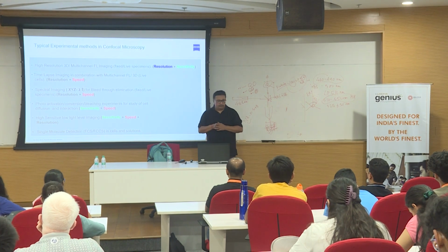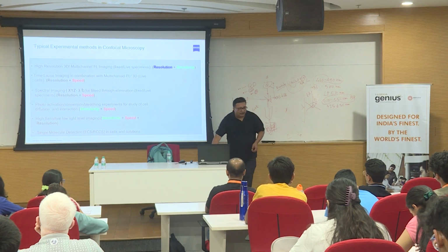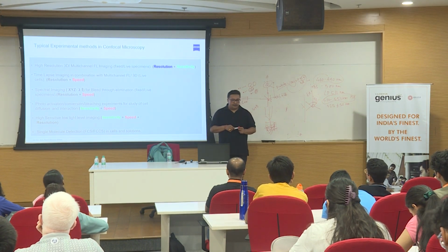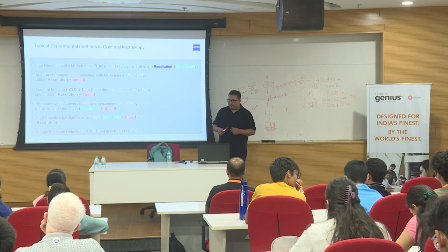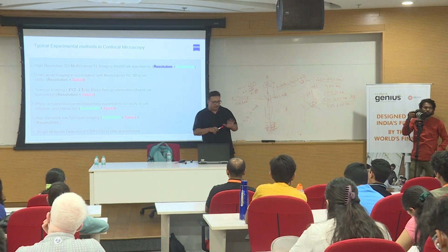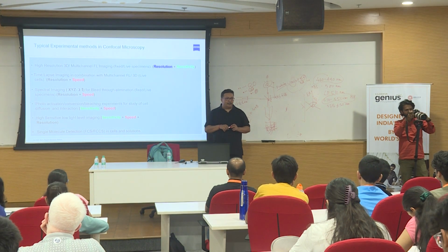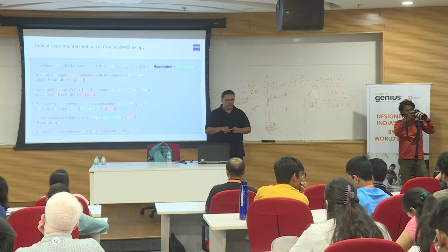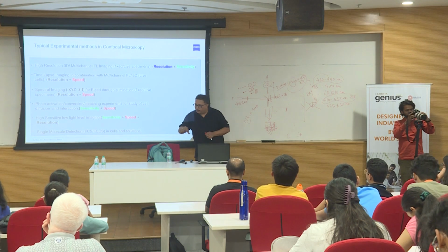Okay. Fine. So when I say that I have a camera and I can use this camera to detect the stars in the night, what does it mean? Or I have a camera, I cannot image in the dark, but in the bright I can image pretty well because my camera is not very sensitive, or I cannot detect low light. So it's all about the faintest information with the minimal amount of noise that can be acquired.